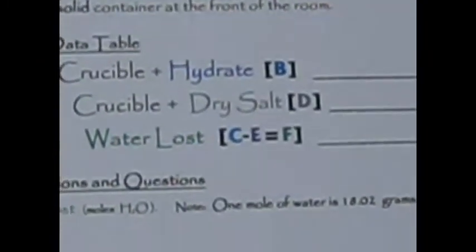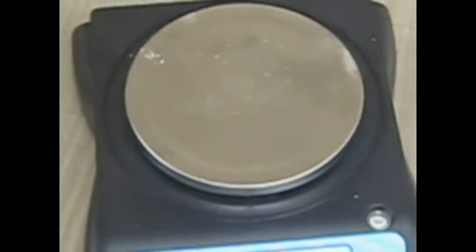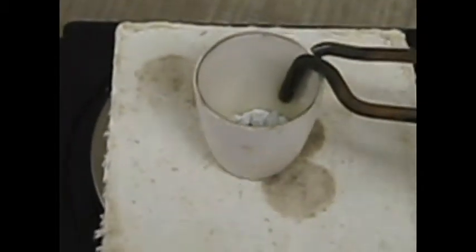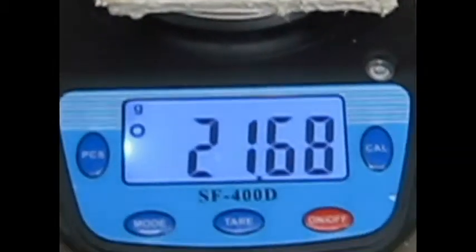So we want to know what the crucible and the dry salt is. So what I'm going to do to protect my little balance, because this is a very hot crucible, I'm actually going to take 2 of these insulating pads. Of course they have a lot of mass, and I want to tare those away. So now it's ignoring those, and that should be enough to protect the delicate circuitry from the heat. So I'm putting this on here, and now this is the mass of the crucible with the dry salt.